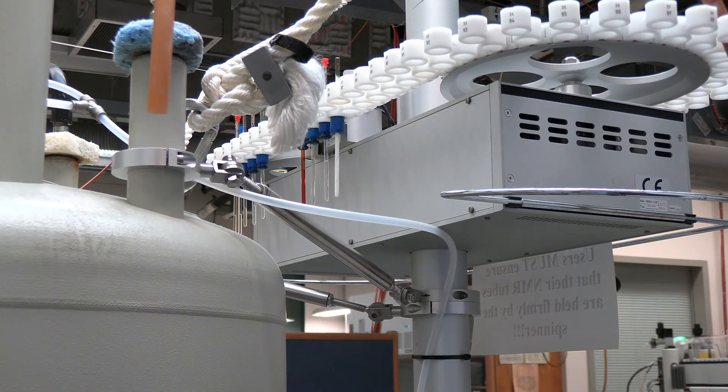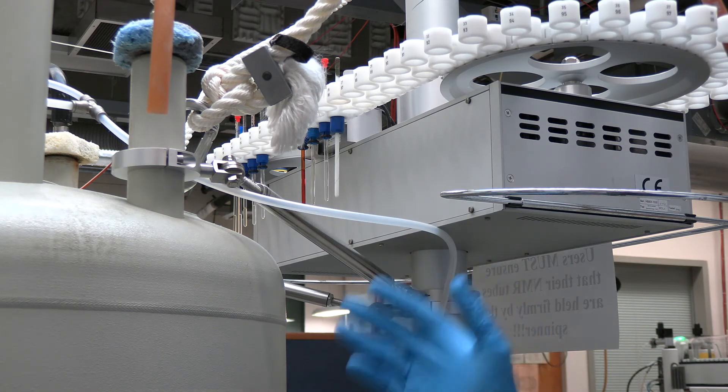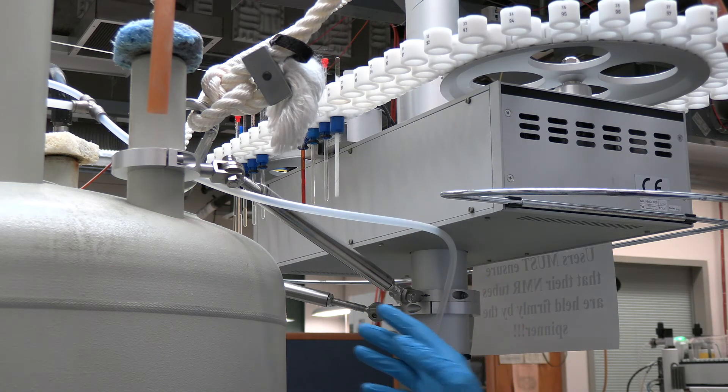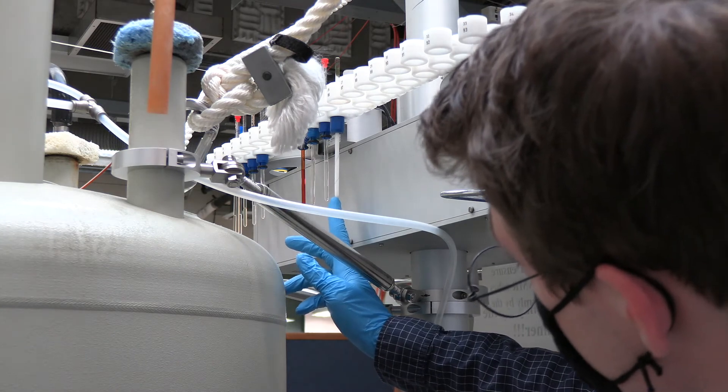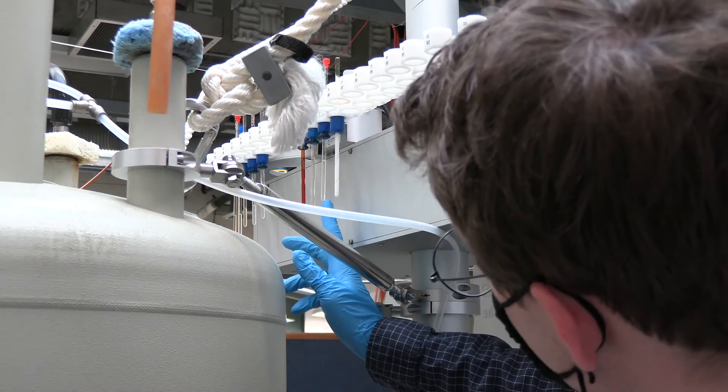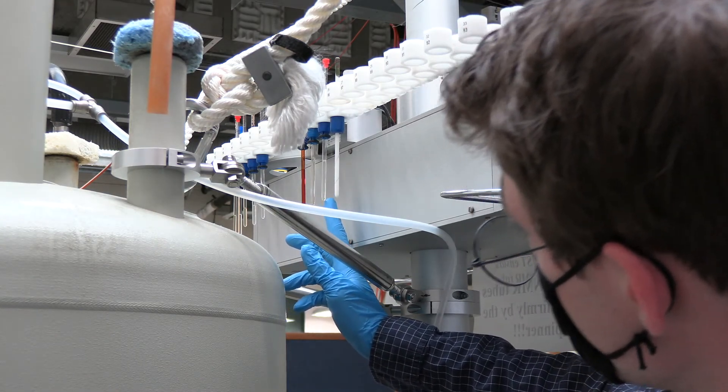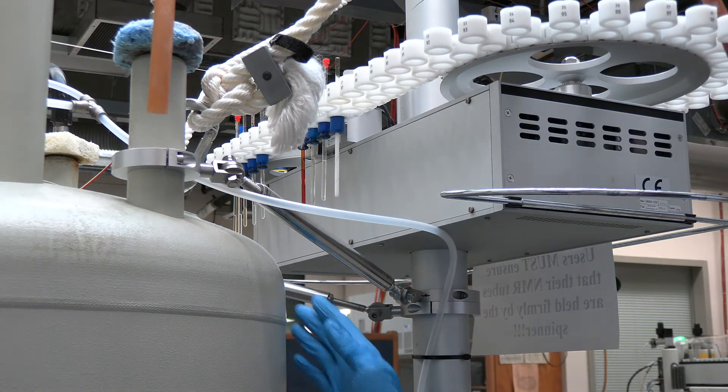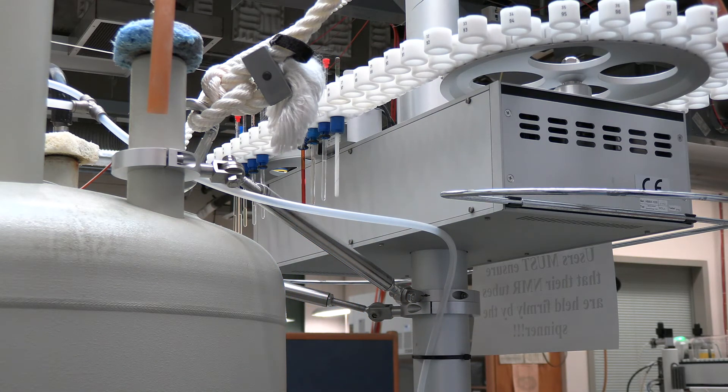Once you have placed your sample on the carousel you will want to make a mental note of what position it is in. As we can see here our sample is placed in position 24. This is important so that you can ensure that once you start adding experiments in the software you are doing so to the correct sample.